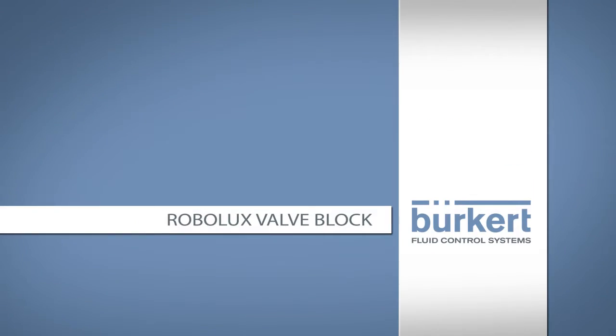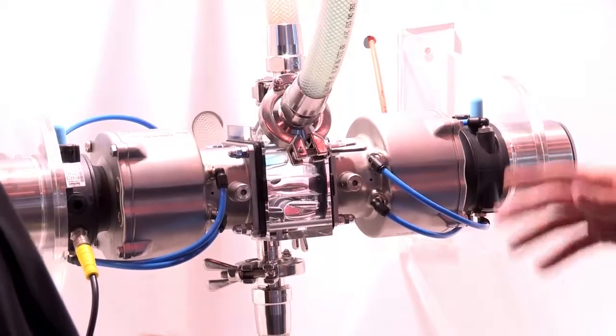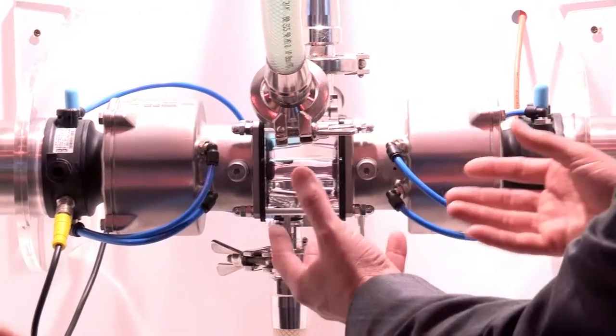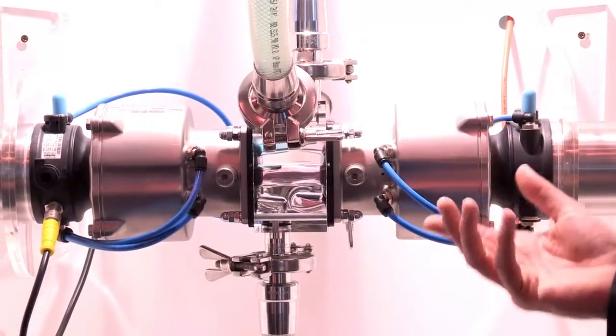The Robolux block solution is a solution where we have two seats in one. It's a diaphragm valve seat and we minimize the design of a complete installation. These are requirements which have been asked for in clean rooms. The double seat Robolux provides minimum dead space in a block solution.